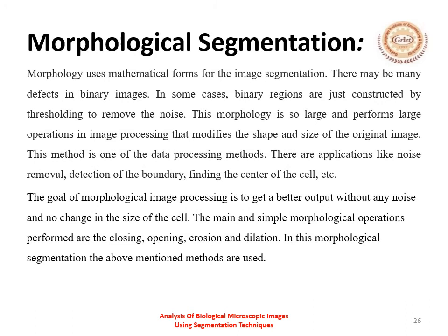Morphological segmentation is a mathematical form of segmentation. There may be many defects in a binary image, so we use morphological segmentation to avoid those defects, remove noise, and get the most important information from those images.